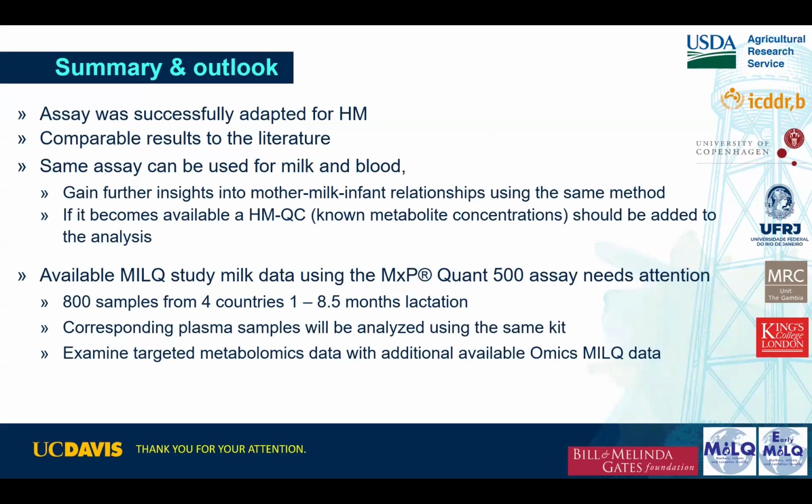And I'm always happy if we can use the same method. It would always be good to have a human milk quality control that you can run with each plate. If you have one that you know the concentration of at this point, as it's always better if you have that matrix match QC than just the plasma QC. I would recommend to run both.